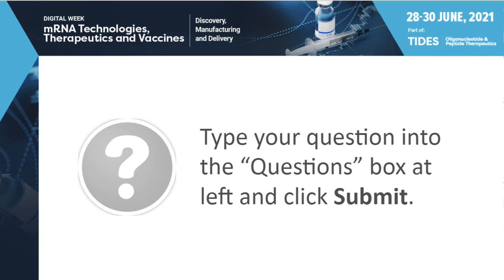Got it. And the last question I'll ask is, does the oligo DT purification remove the dsRNA too? Great question. So I didn't show data supporting that today. Well, it can remove some level of the contaminant. It is not our preferred method, as the reduction is not as significant as other options we have in our toolkit.